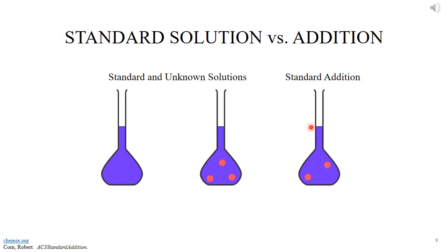In this experiment, standard addition is a better technique than standard solutions. This is because the multivitamin contains many binders and other vitamins that cause interferences. For standard solutions, the linear curve is made from pure solutions, while the unknown has interferences that are not taken into account.